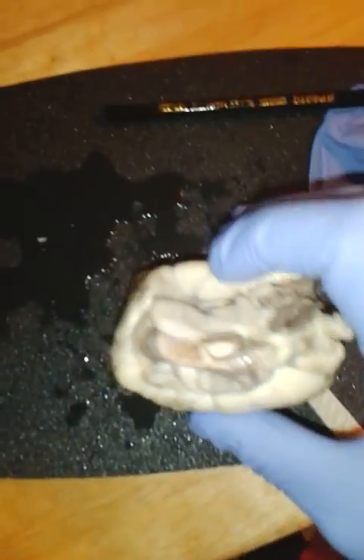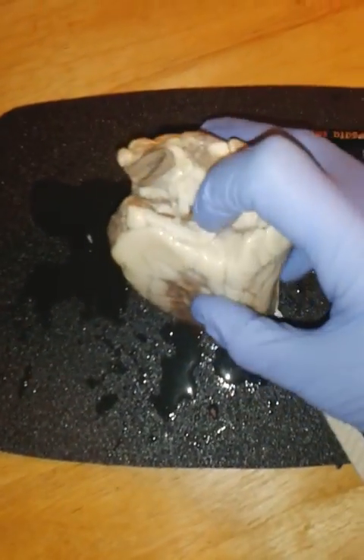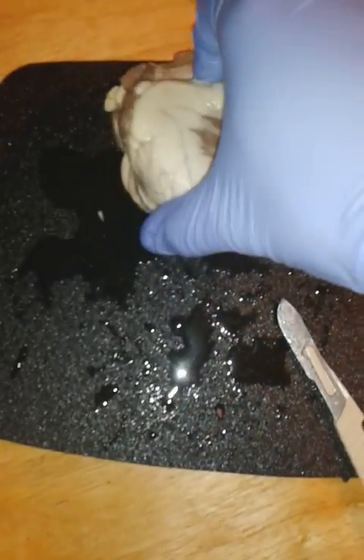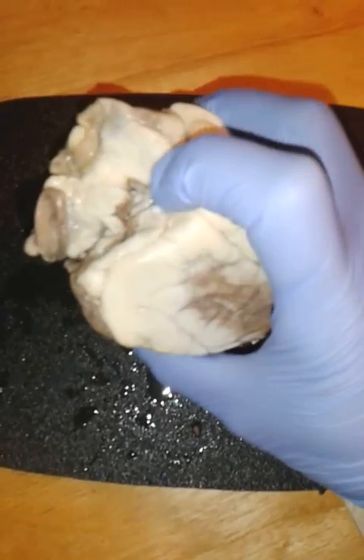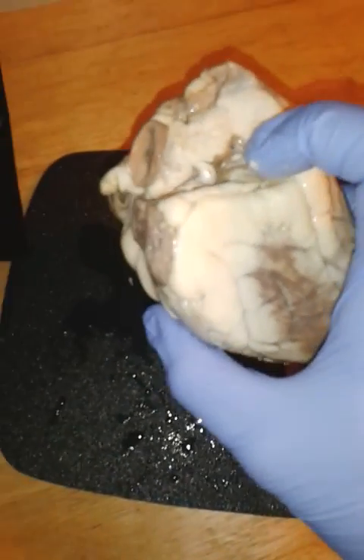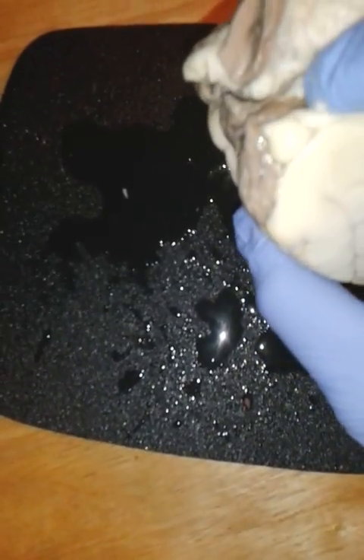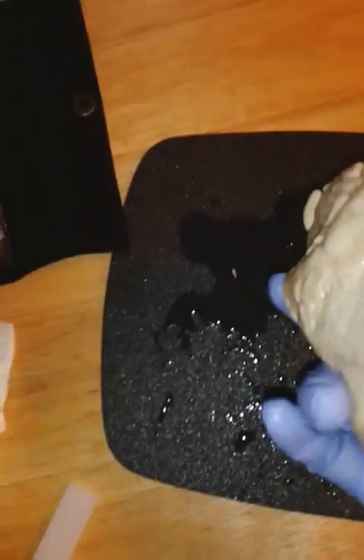The superior vena cava can be best appreciated from the posterior side, right here. This opening here where you see it darkening. The inferior vena cava is actually right alongside it.